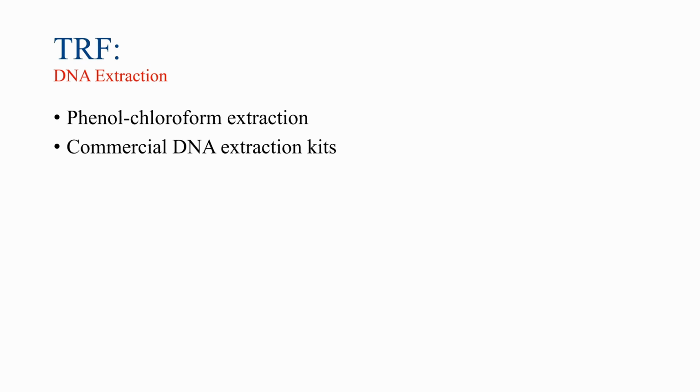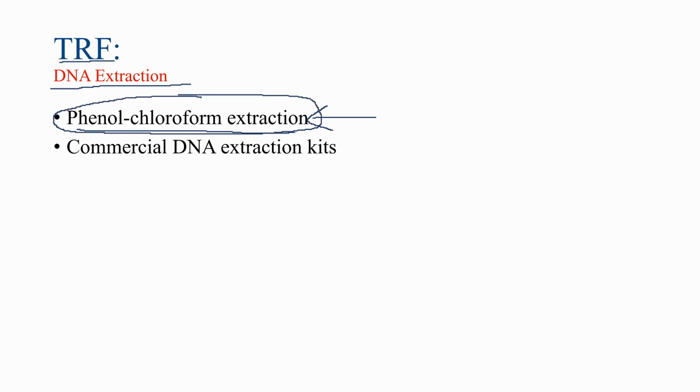So let me begin with the first step of TRF, which is DNA extraction. So for DNA extraction, you can utilize phenol-chloroform extraction. I have a whole module on phenol-chloroform extraction, so I will not go over this right now. But in addition, commercial DNA extraction kits can be used, obviously, for the DNA extraction part.